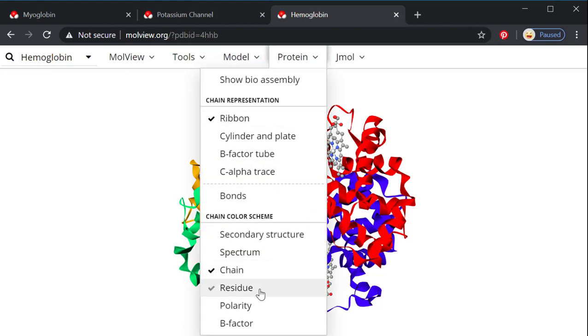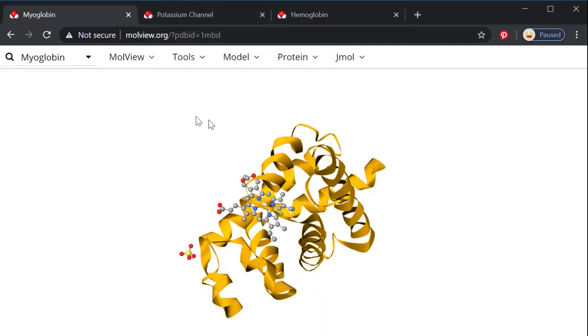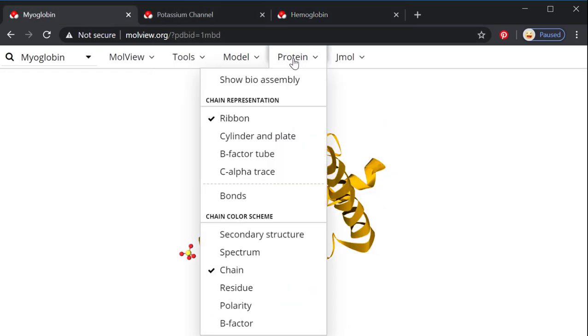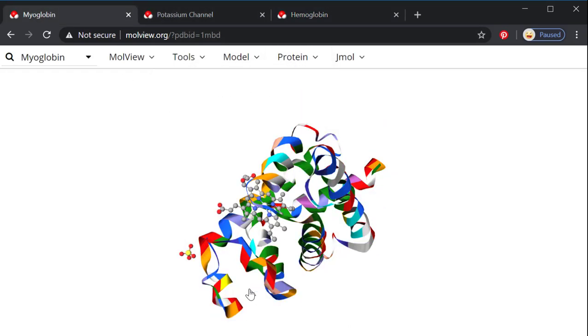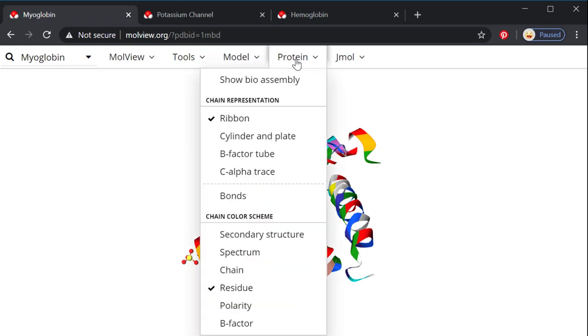Other things that we can look at, let me go back to myoglobin because it's small. We can look with a residue view and here each color would represent a different amino acid. I don't find this very helpful except to show that there's a lot of different amino acids here.